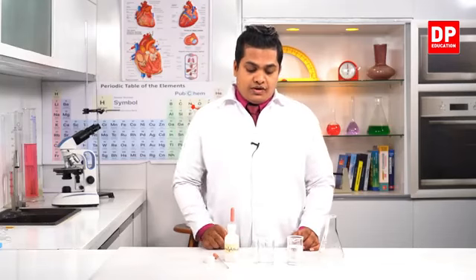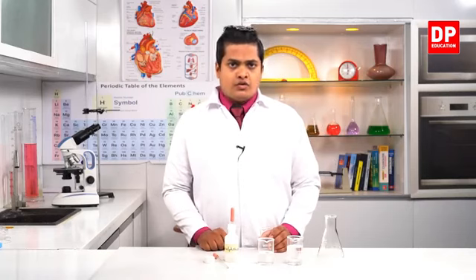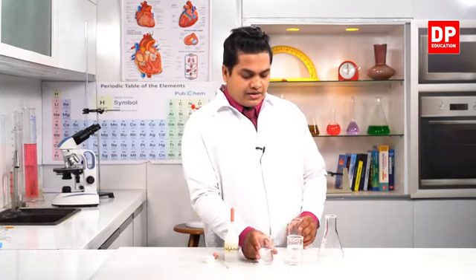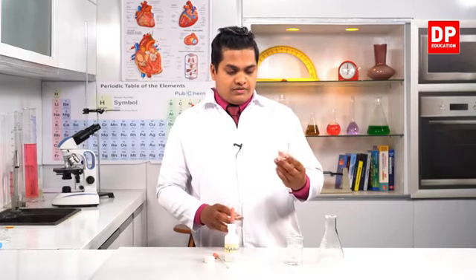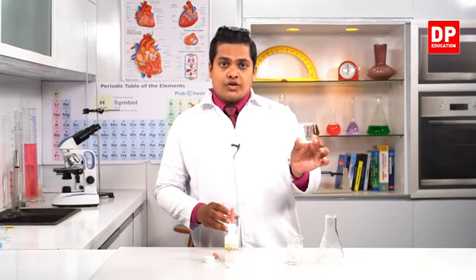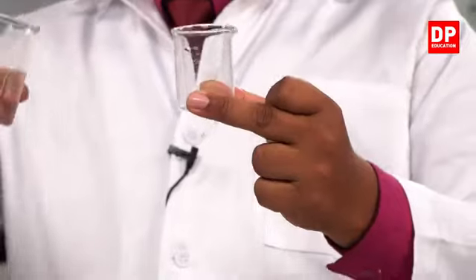First of all, we'll measure about 30 milliliters of sodium hydroxide, to get more accurate observations very clearly. We'll get about 30 milliliters of sodium hydroxide solution into this smaller beaker.